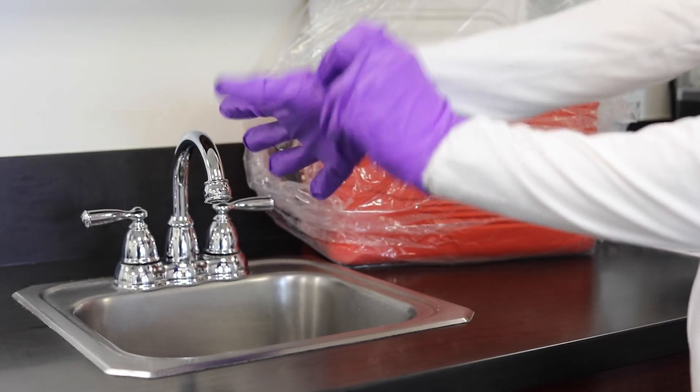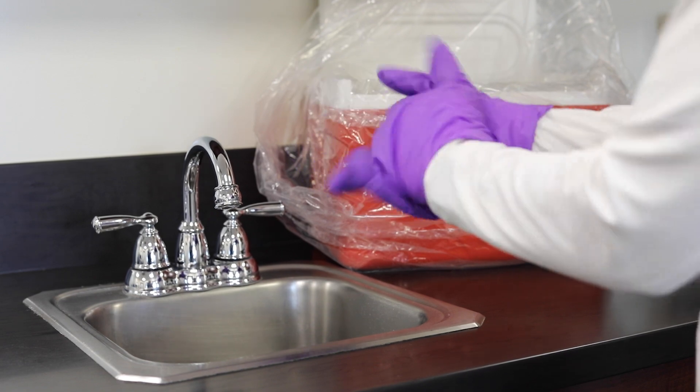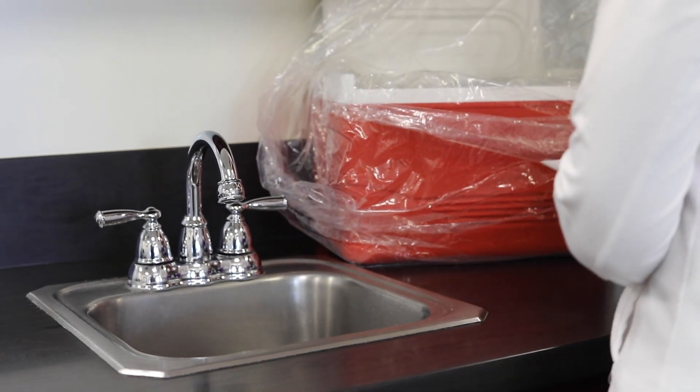Before touching any sampling bottles, put on the powderless nitrile gloves provided. You'll be wearing these during all sampling steps. Latex gloves are not an acceptable substitute.